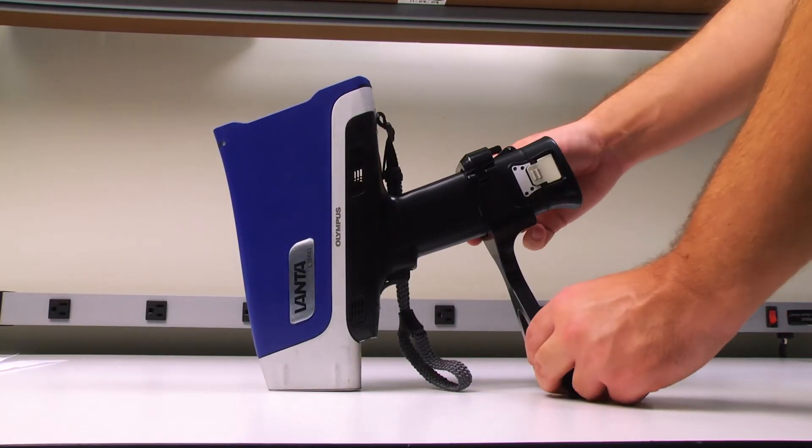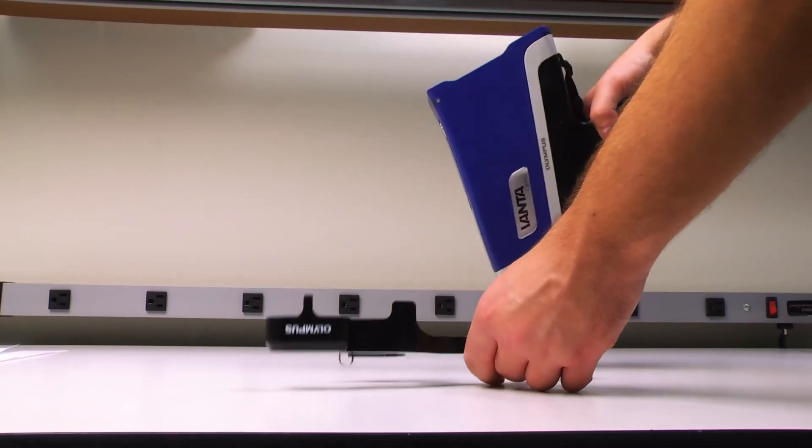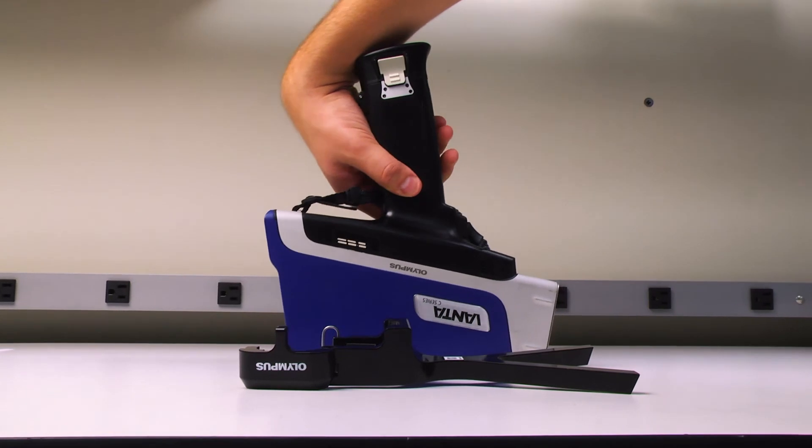To remove the soil foot, simply pull out the side clip, remove the top piece, and pull out the Vanta. I hope showing you how to use these cost-effective, easy-to-use field accessories for the Vanta has been informative.